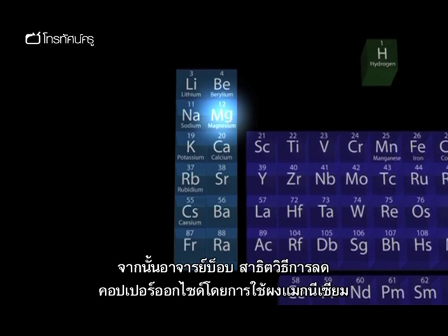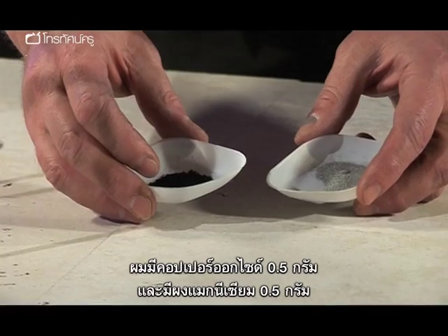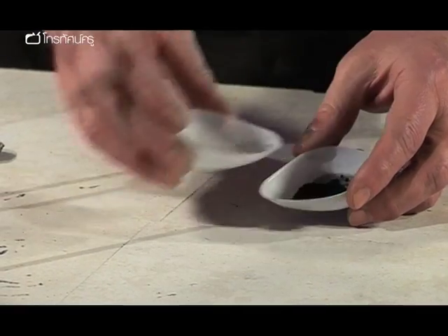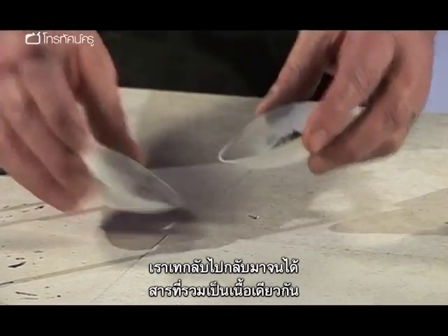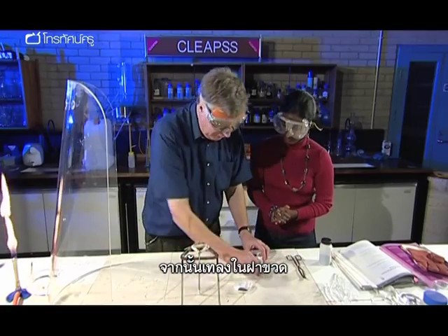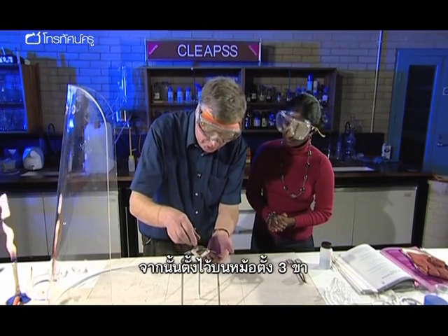Bob then showed me how to reduce copper oxide using magnesium powder. I've got here some copper oxide, 0.5 of a gram, and 0.5 of a gram of magnesium powder. And we can pass one to the other as quickly as possible like this to get a nice homogeneous mixture. We'll pour that into our bottle top. We'll place that on the pipe clay triangle.